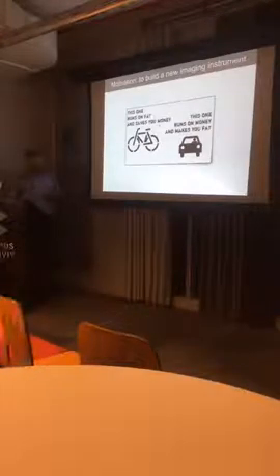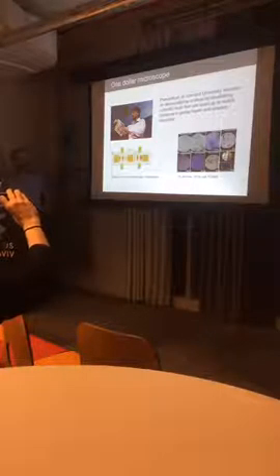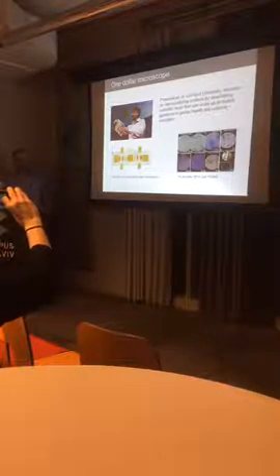And I also have somebody that I like very much. This guy is Prakash, Dr. Prakash, a professor from Stanford University, and he succeeded in building a microscope from paper. And Ilya mentioned that they also ordered such microscopes for a workshop. More than that, he succeeded not only in making it as a toy, but also in publishing it in PLOS ONE as a real scientific paper based on this simple $1 microscope.